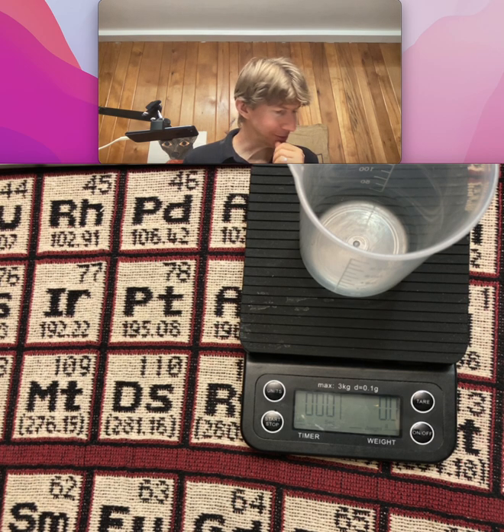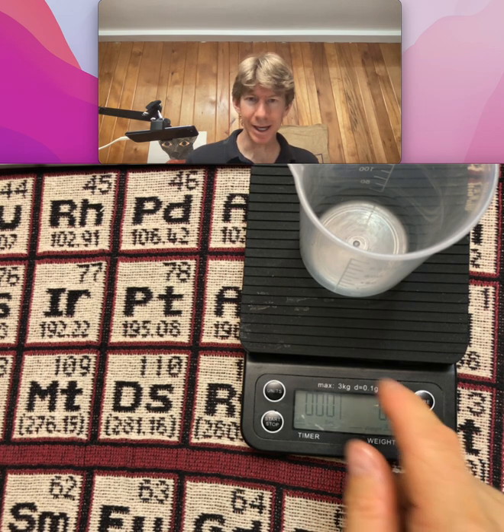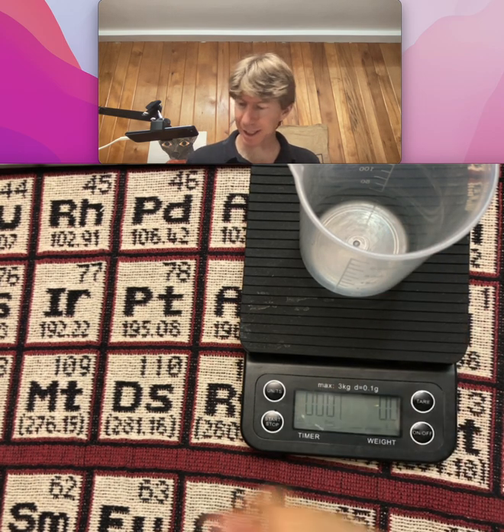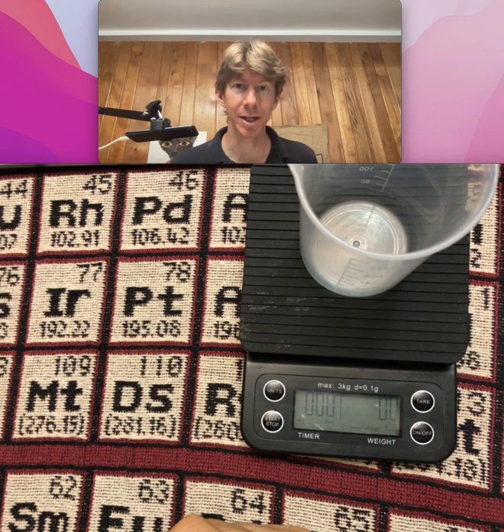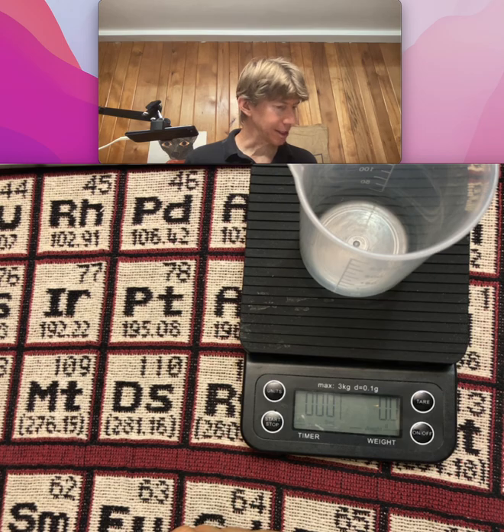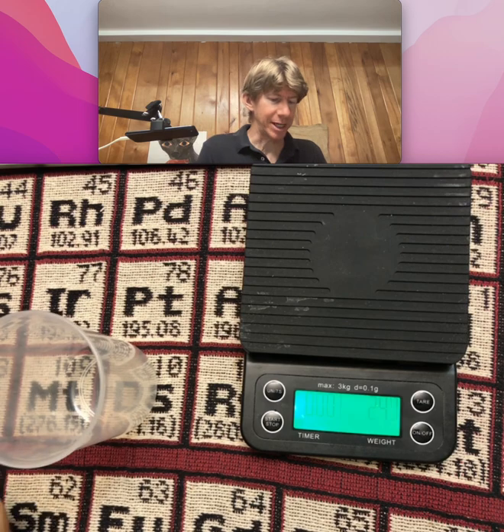Now, place about 65 grams of roasted coffee beans into a clean, dry 250 milliliter beaker. I've got that here on my scale, and I've got it zeroed with the beaker on the scale, so when I weigh out my 65 grams I'm just looking for a total of 65.